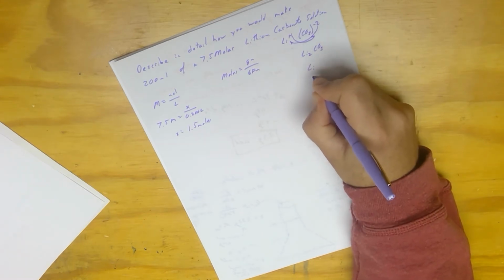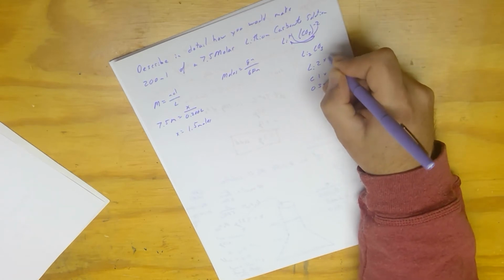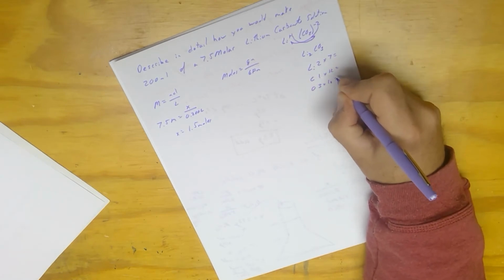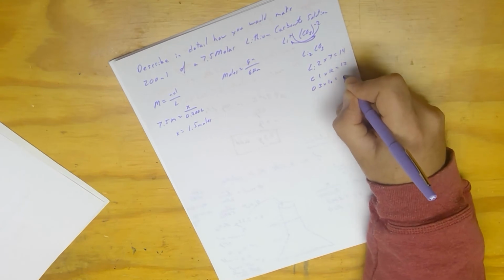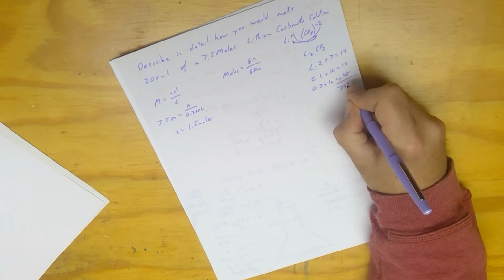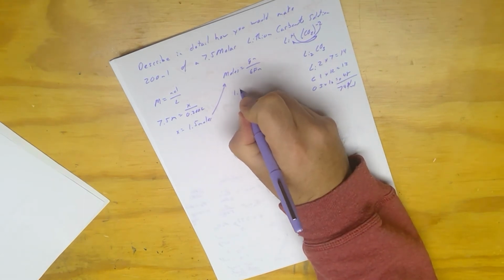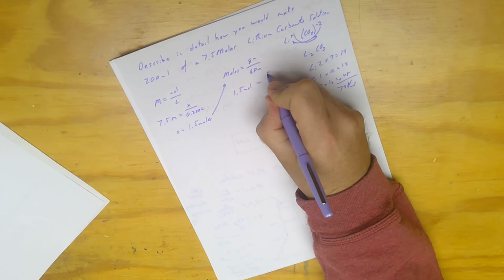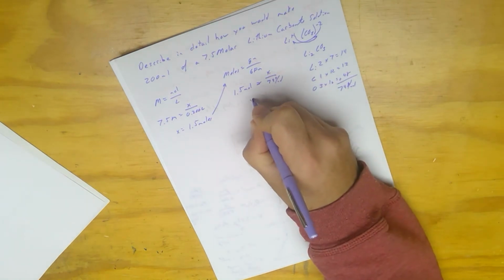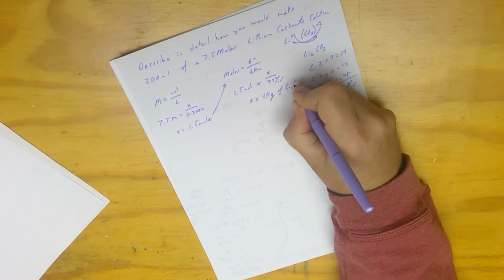All right, so now we have to do GFM. So we got Li's and C's and O's, and we got 2 of these and 1 of these and 3 of these. Lithium is 7, carbon is 12, oxygen 16. Multiply across, we got 14 and 12 and 48. We add and we get 74 grams per mole. That's going to go here. So we have 1.5 moles equals X over 74 grams per mole. It turns out we need 111 grams of the Li2CO3.